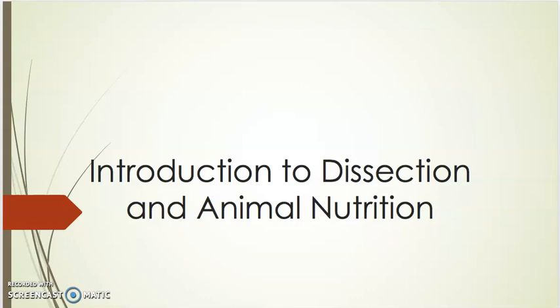If we are going to do a dissection on an animal, we are going to show you many different systems to show respect for the animal and what the animal can teach to us. The reason I am making this video is because some of these points about the digestive system of the pig and about other systems are not well pointed out in the video on the dissection that I want you to look at, and they are not very well pointed out on the lab website, but they may show up in your final exam, and I want you to be prepared for that.